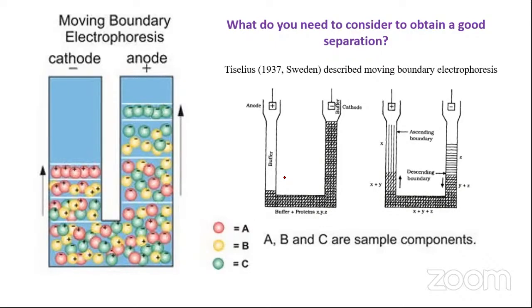No matter whether you use a linear tube, whatever be the case, say suppose you are using a linear tube, one end is positively charged, the other end is negatively charged. You somehow have placed your sample over here in between, as the mixture.